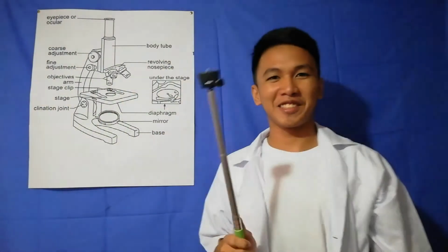With the help of my magic wand, I will teach you the parts and functions of a microscope. So let me find my magic wand. 12 seconds later. Here it is. Magic.